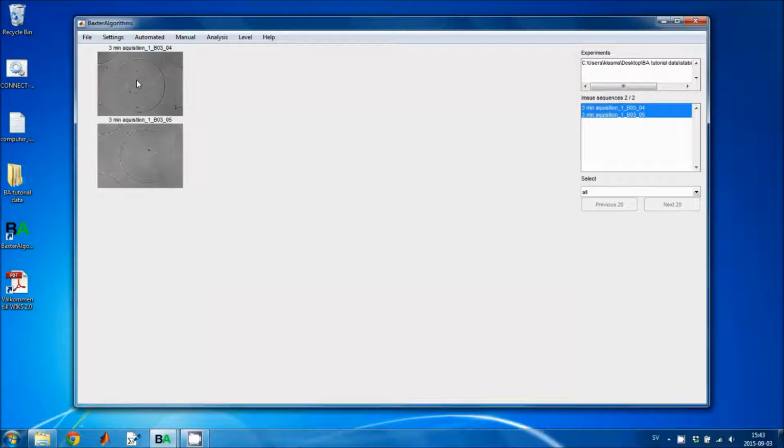This can be useful if you want to speed up the processing, because you don't have to process as many pixels if you do this, and you also get nicer figures for papers and stuff like that. And if you want to perform image stabilization and cutting on a dataset, you should do the stabilization first, because the stabilization can introduce image artifacts at the image boundaries, and then if you cut afterwards you get rid of these artifacts.